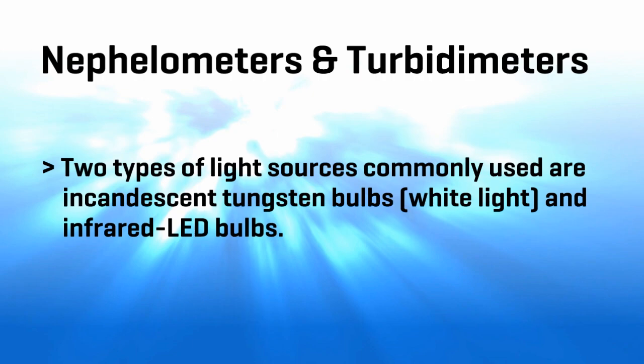If you're doing natural waters or anything with a higher turbidity, then you're probably better off going with the other alternative, which is an infrared or LED bulb. It's just better suited for those higher ranges.